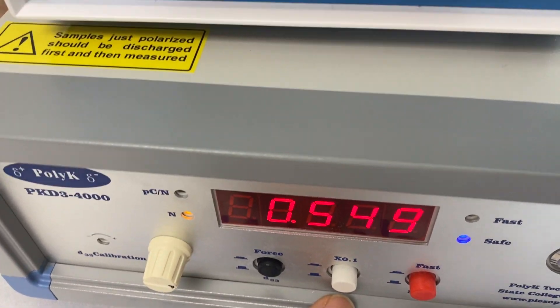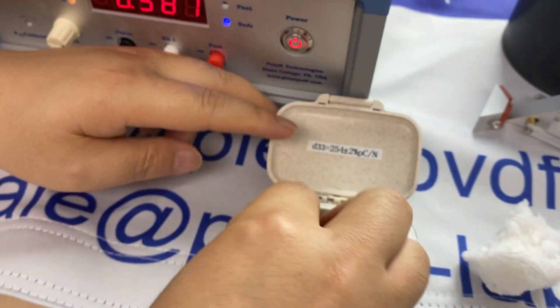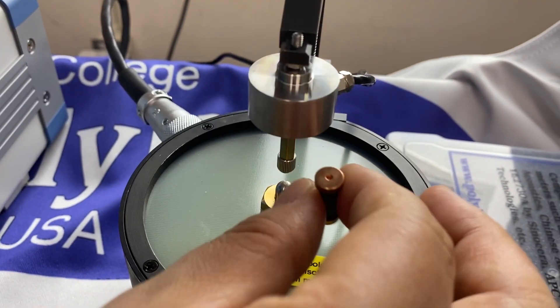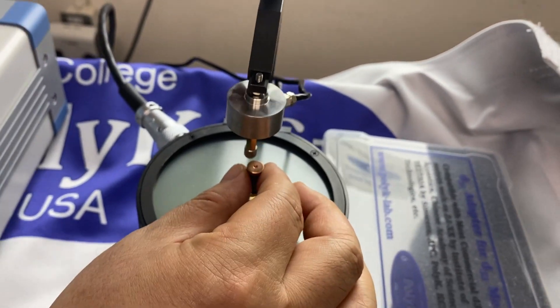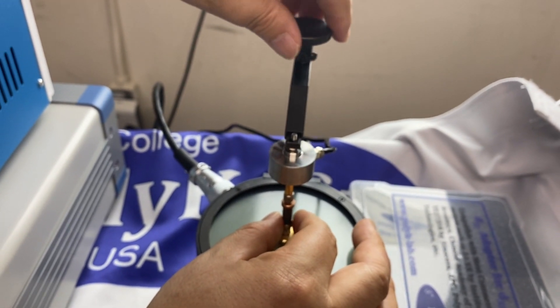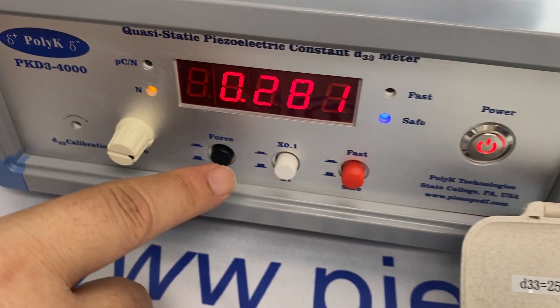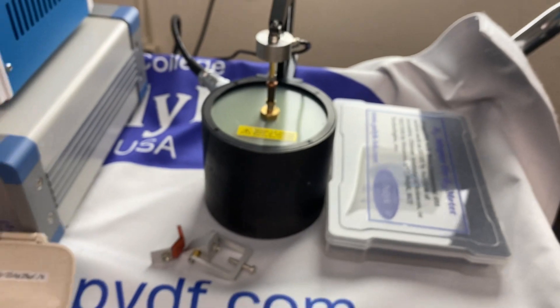Let me set it to the ×1 range. To do the calibration, we have a calibration standard with a D33 of about 254 picocoulombs per newton. You load the standard between the probes — it's easy to do calibration. The shaker generates a dynamic force of about 250 millinewton or 0.5 newton. Right now we are reading 280, but D33 should be 254, which is why we need to do calibration.